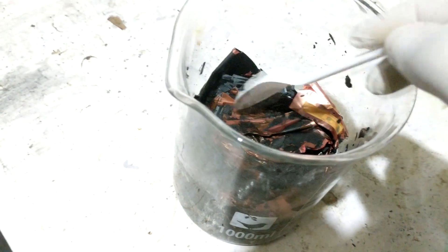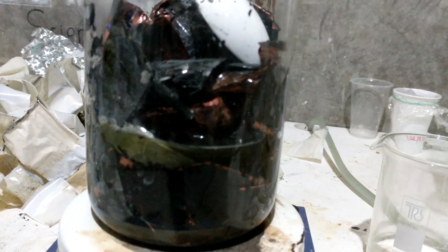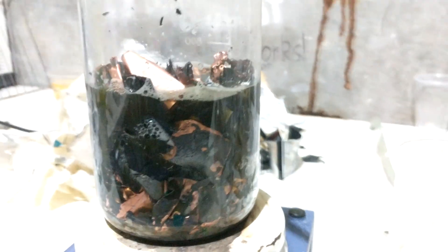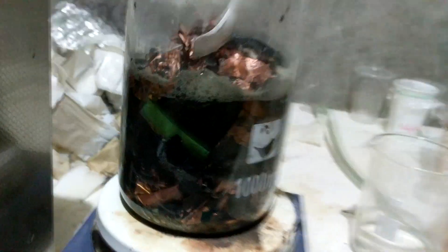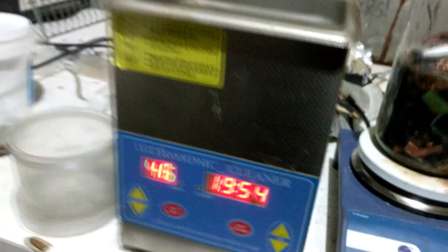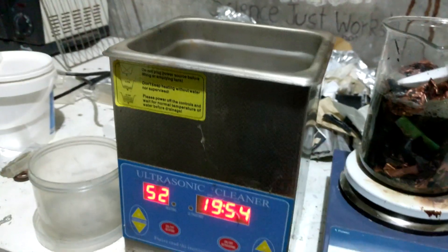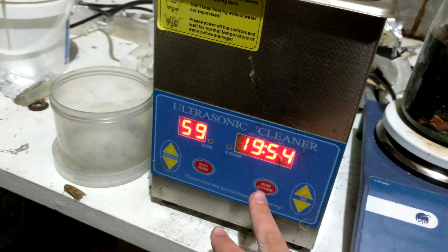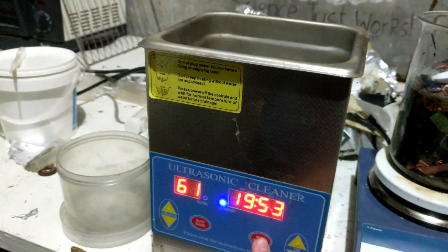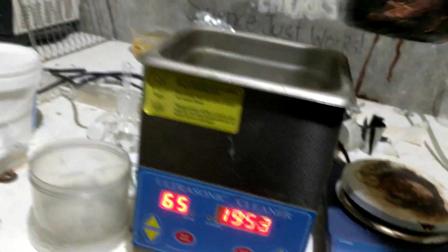We're just going to put it through this funnel — hopefully the funnel catches anything big. What I actually have here is an ultrasonic cleaner, which I think will work really well for shaking the stuff off. I don't use this very often — actually it's my dad's — he occasionally uses it for cleaning stuff. Both of us don't really like using it because it makes the most god-forsaken noise ever — it's so high-pitched and grating.